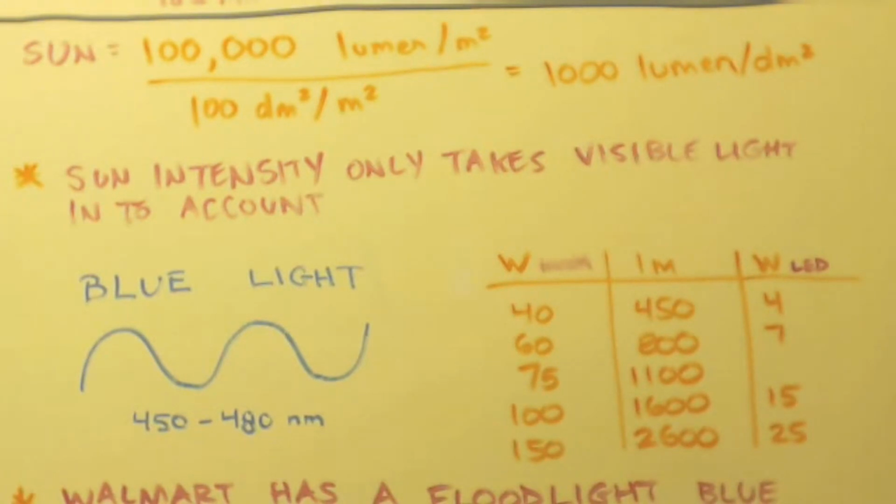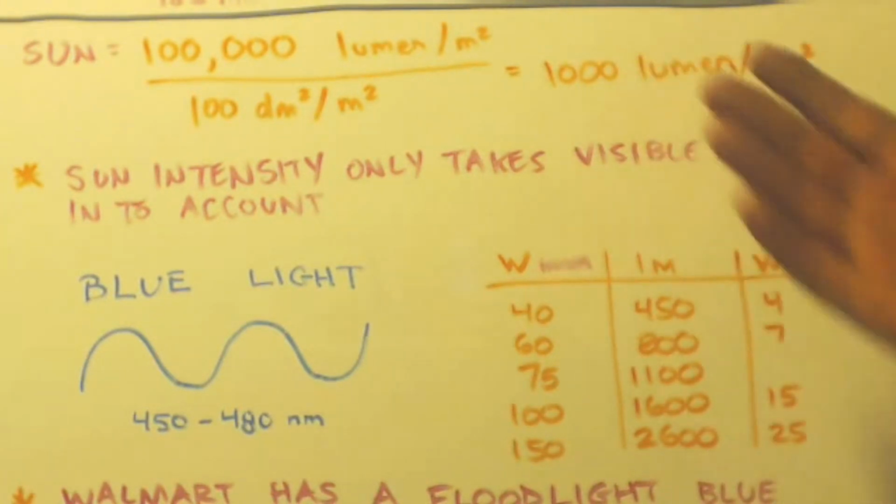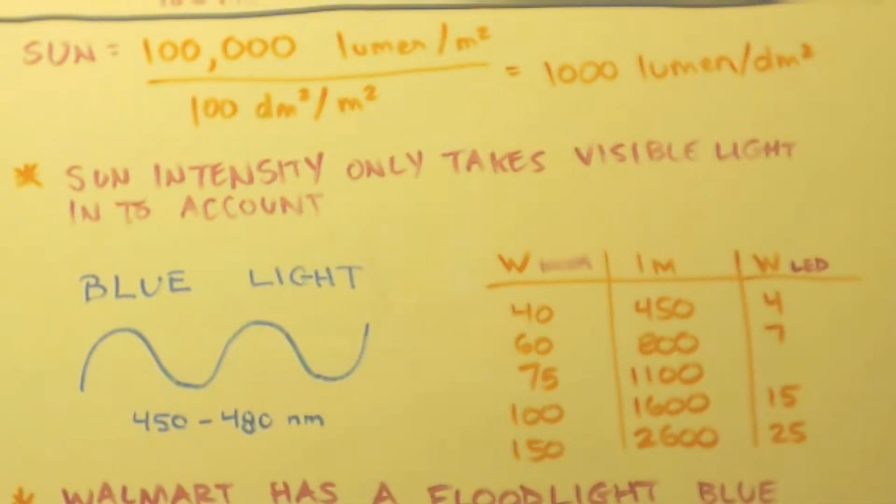But they are counting orange light, red light, yellow light, some of the green light. These wavelengths are not strong enough to break our chlorine-chlorine bonds. They're no good to us. So them including them in the lumens is useless to us, right?